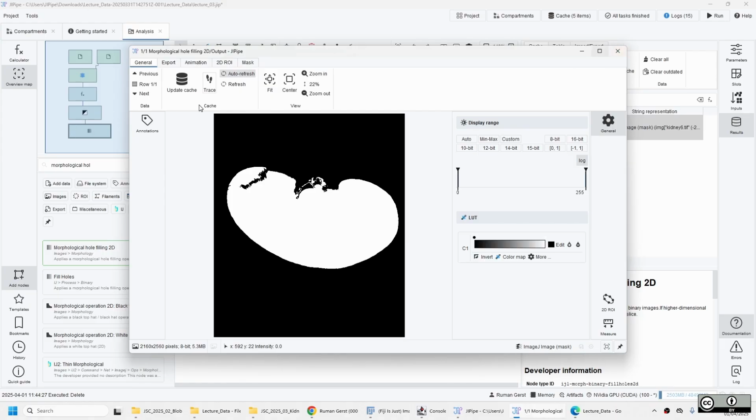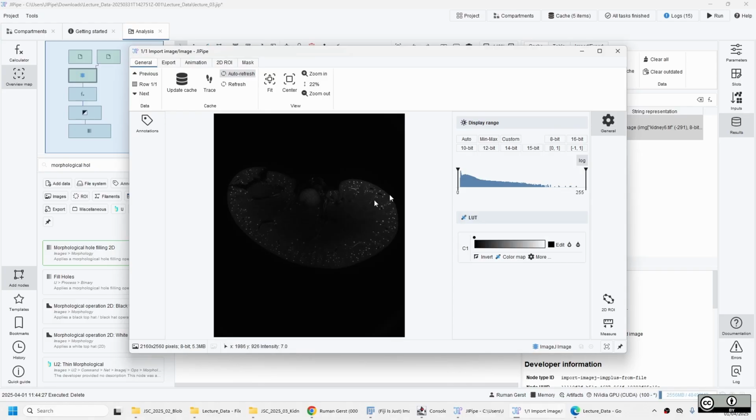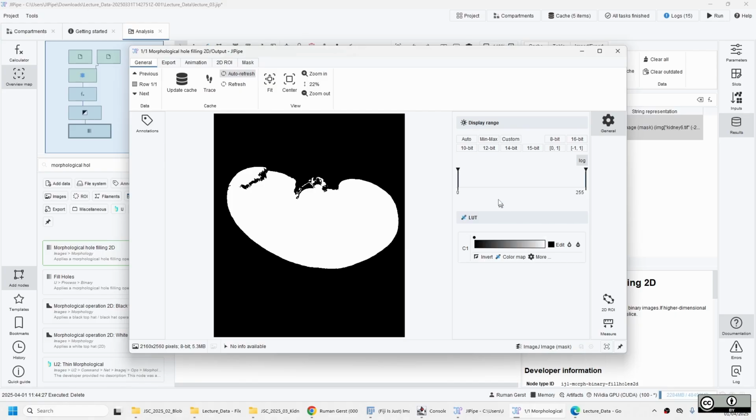You see, if I go back, we have this cut, also all these parts here disconnected. Something that we have to account for. And this is why I explained this protocol where you apply the hole filling together with some morphological operations. Remember, you dilate first, then you apply the hole filling.